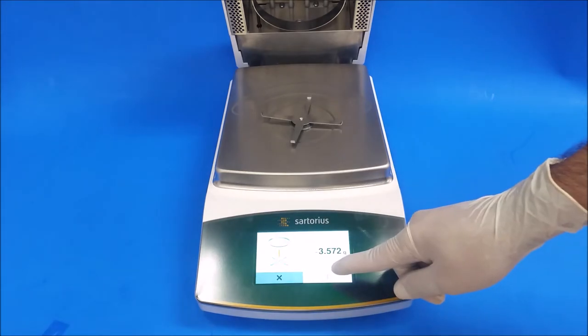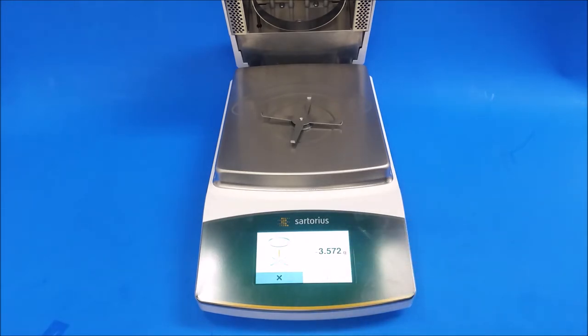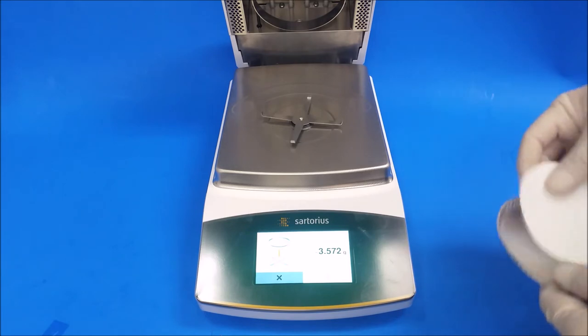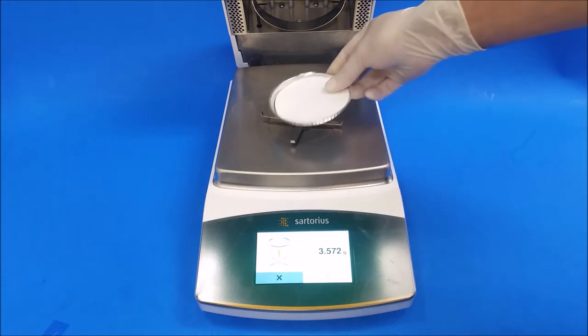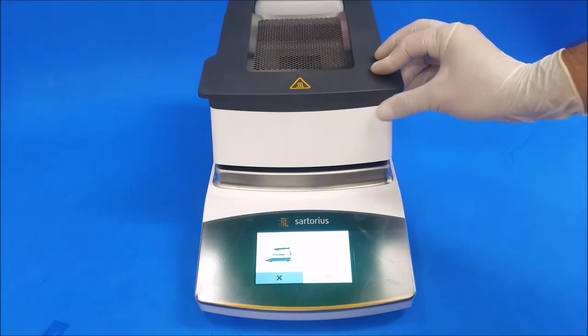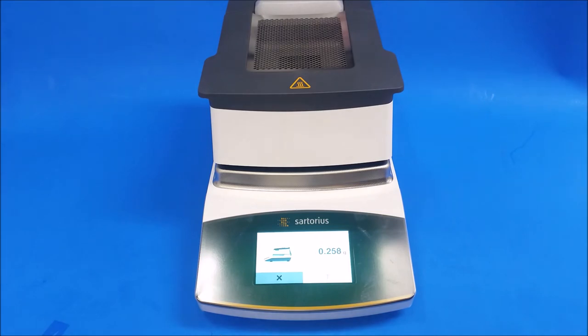And you go to new. Just follow the steps. Just add your dish, your pad, new pad. Close, and you're ready to run a new test.